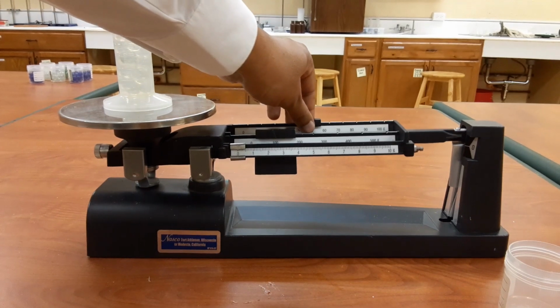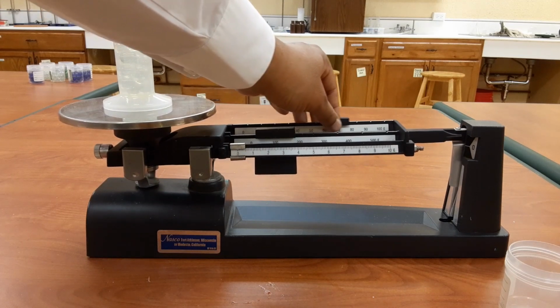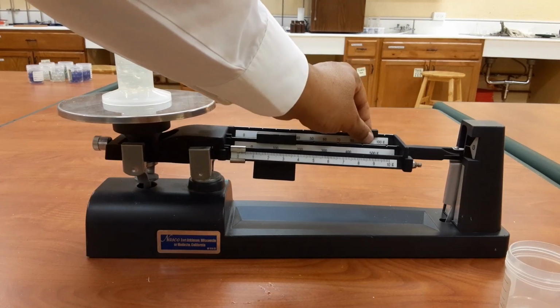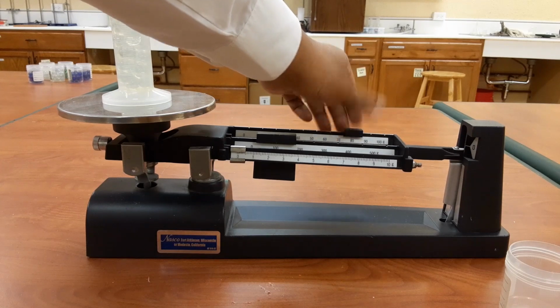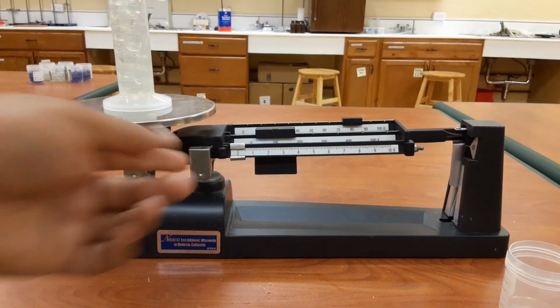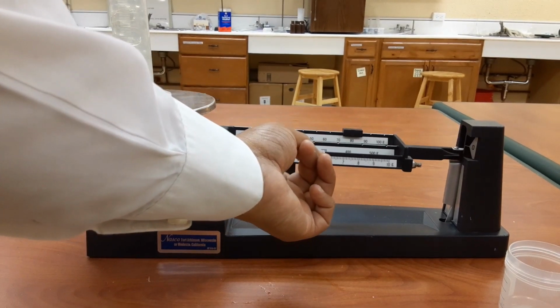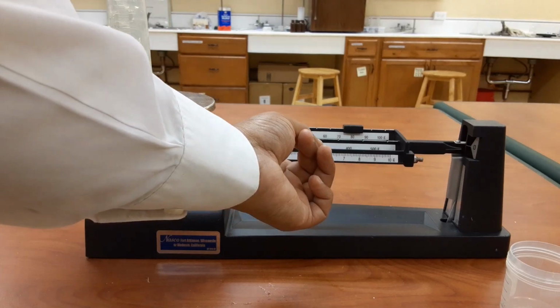So it's more than 140, more than 160, more than 170, less than 190, more than 180. Right. So now move the smallest slider, and it is now balanced.